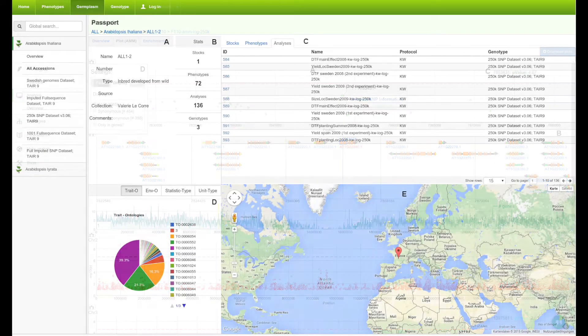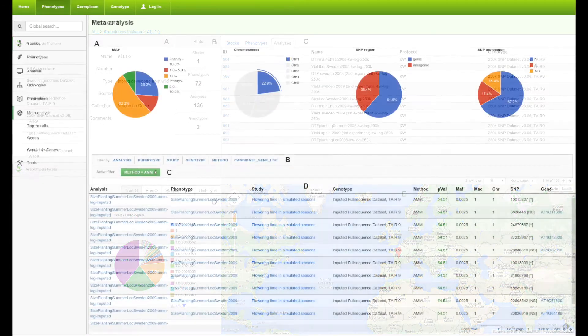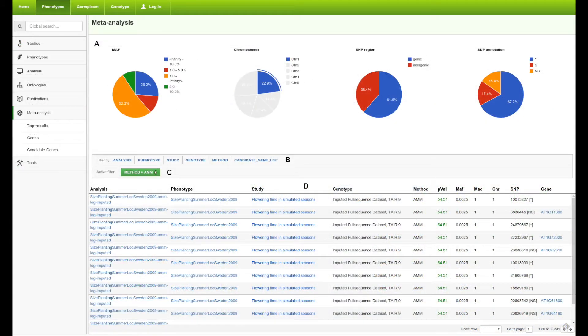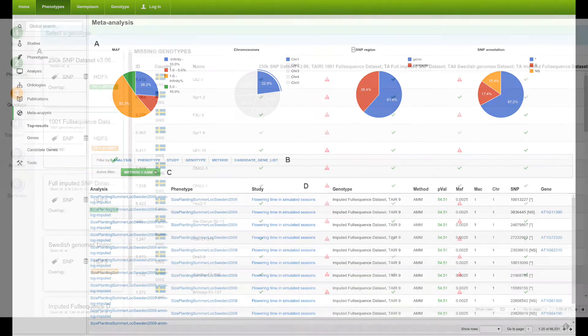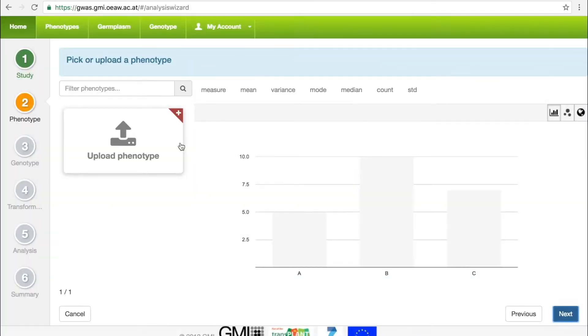The following three videos will take the user all the way through uploading a phenotype, performing the genome-wide association analysis, interpreting the results, and finally performing a meta-analysis.